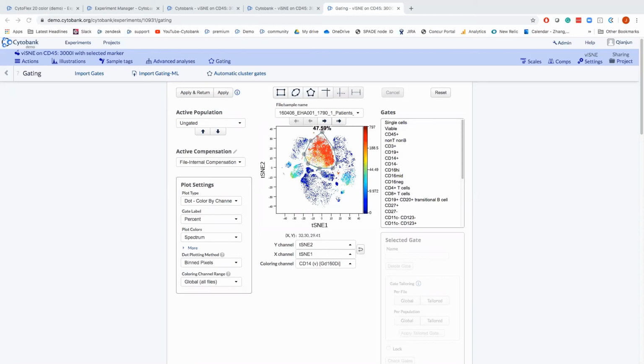That's perfect. Okay, another very good question. If we are using a seed function, does this mean that we can generate an analysis template for longitudinal experiments for future use?